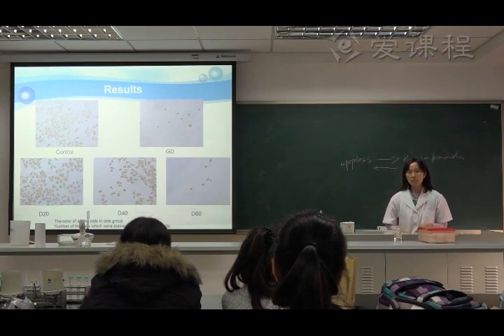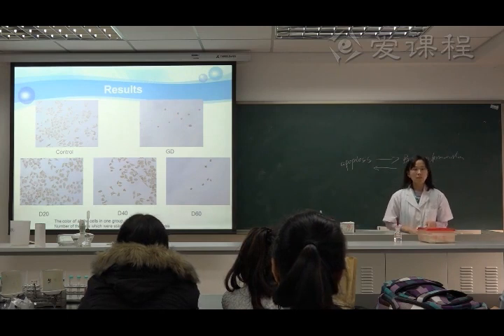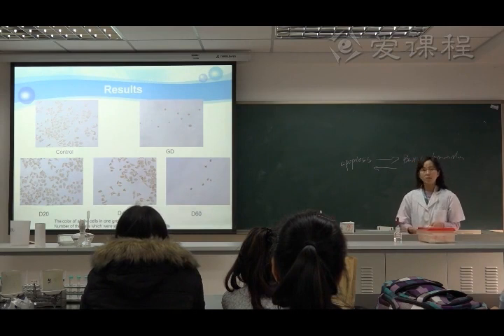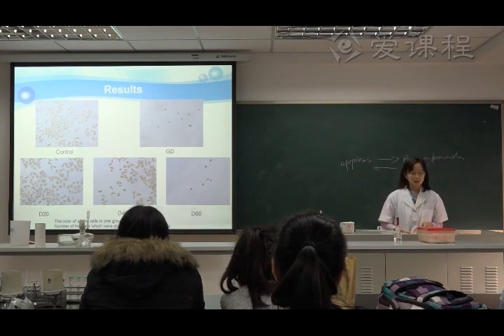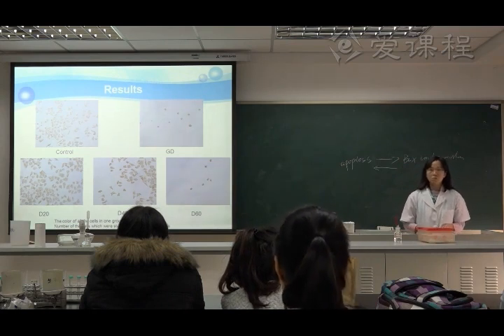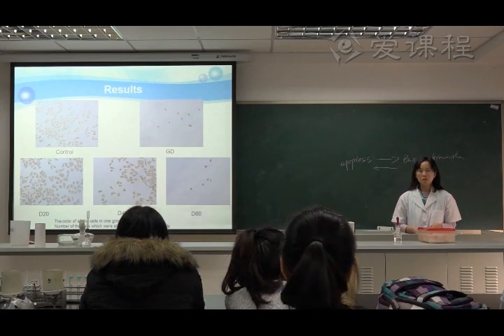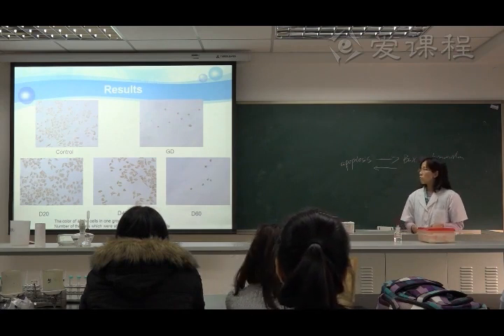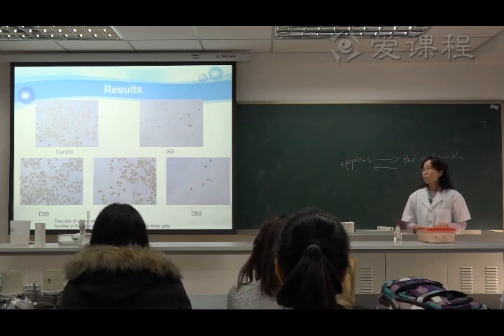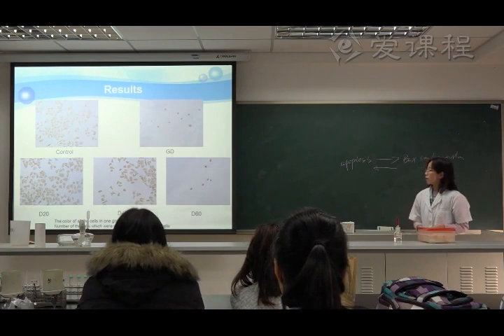If you think this result is reasonable and you can get some data to support your explanation, it's okay. And I just hope that from the whole cytobiology experiment, you can know that if we want to make sure of a phenomenon, we need to do a serious experiment to make sure.